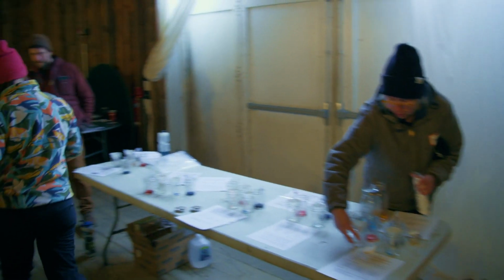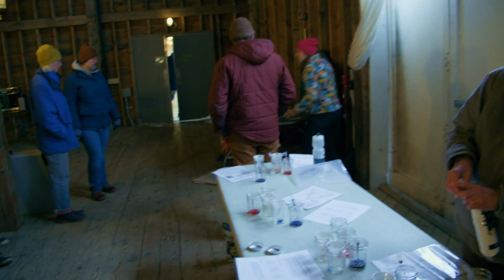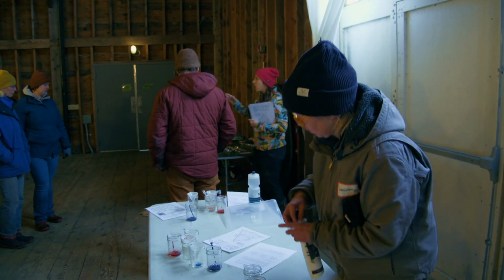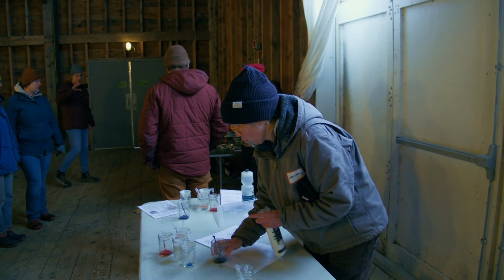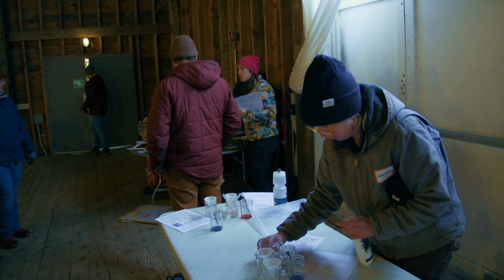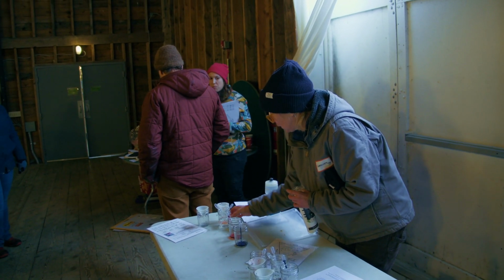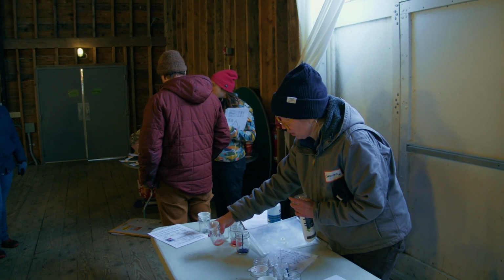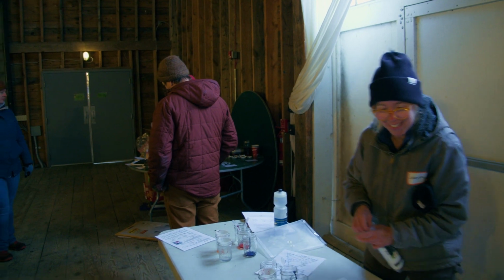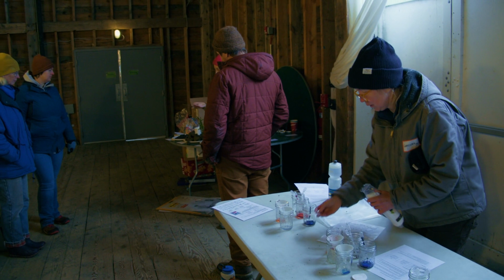So what we're going to have you do is split up into pairs, and then come over to this little table, where we have the 3 different soil samples already weighed out for you, the right amount that you'll need for the CEC and AEC activity. Each pair is going to grab 2 pre-weighed tins of the same kind of soil, and whichever soil you got, you bring it over to your little chemistry station, which will be set up by the time you've got it, and then you're going to come back over to the plates. Remember which kind of soil you grabbed, and grab enough to fill your little hand.